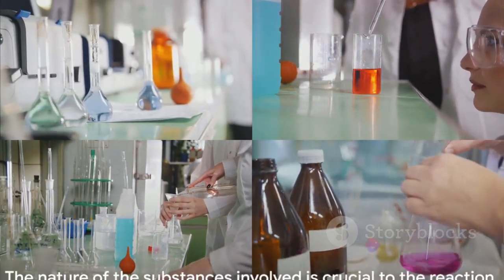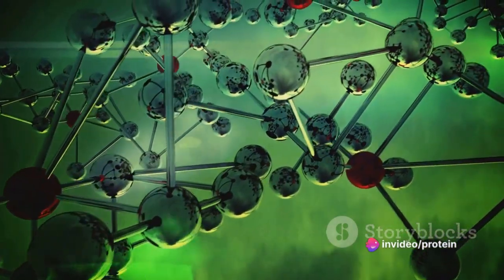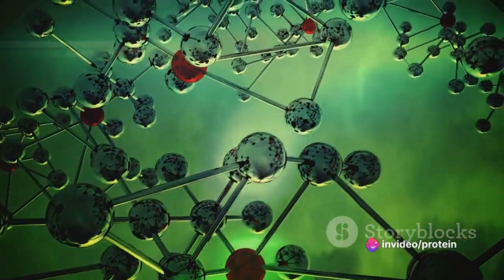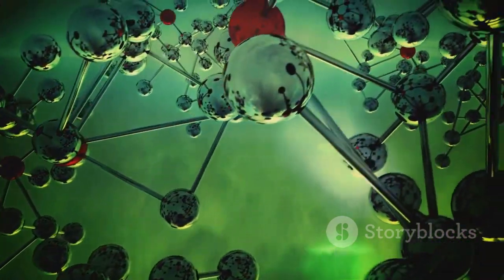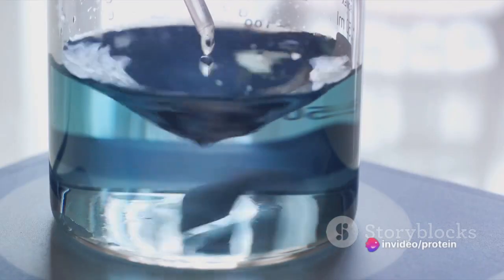But why? The reason lies in the nature of the substances involved. Sucrose, despite being a solid, has a crystalline structure that allows the sulfuric acid to penetrate and interact with it. As the sulfuric acid absorbs water from the sucrose, it begins to heat up. This is an exothermic reaction, meaning it releases heat.